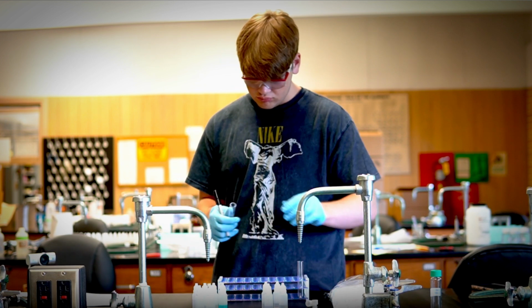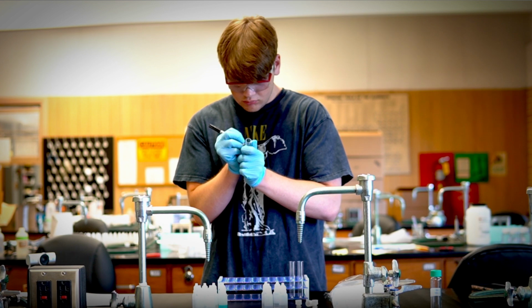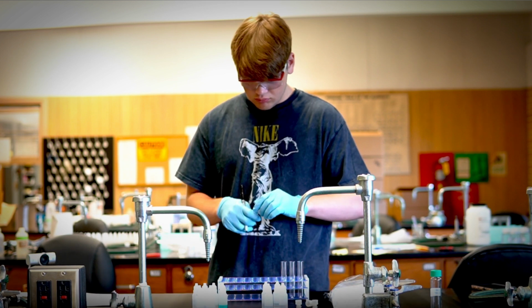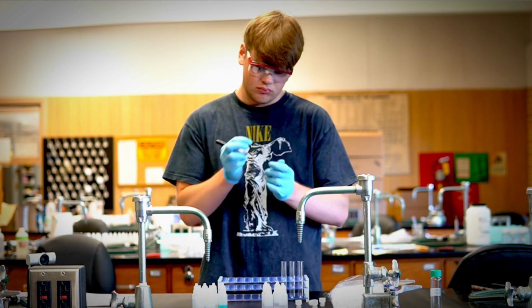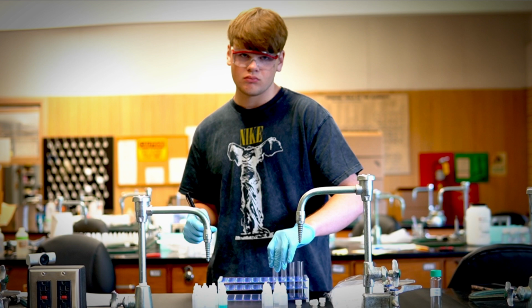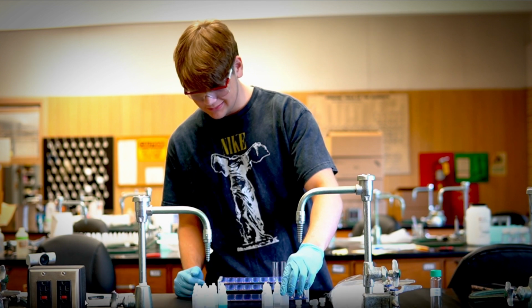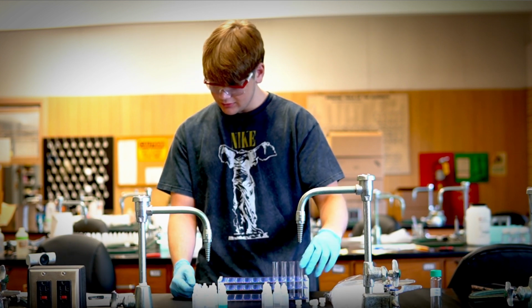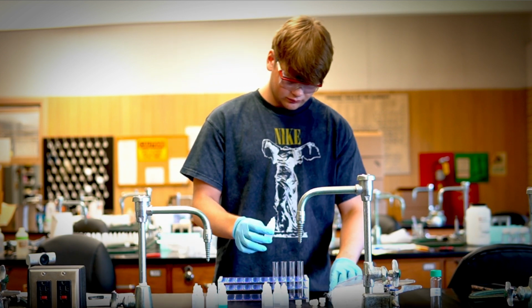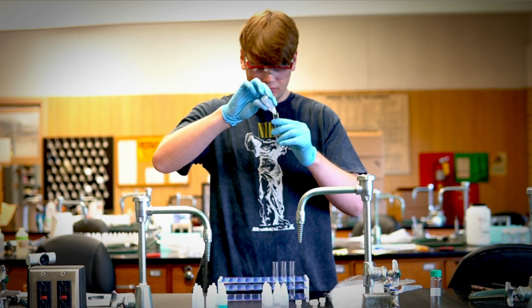So just like the procedure shows, you're going to test 6 chemicals. But in order to do that, you're going to start by testing your cations. We do have 3 cations to test. You're going to test your 3 cations plus the unknown, so you have 4 cations. And in order to test the cations, as we discussed, we're going to use ammonia and NaOH. The way to do it is you're just going to add some drops into your solution.